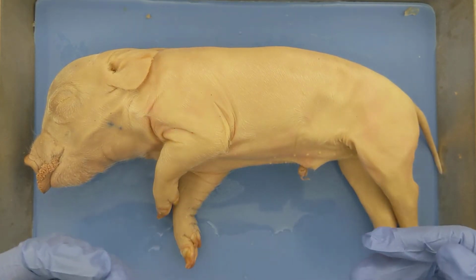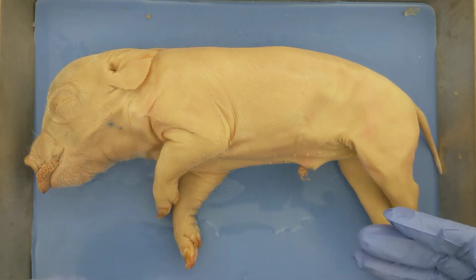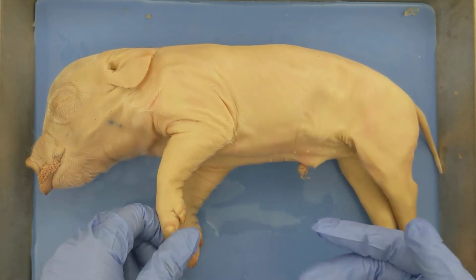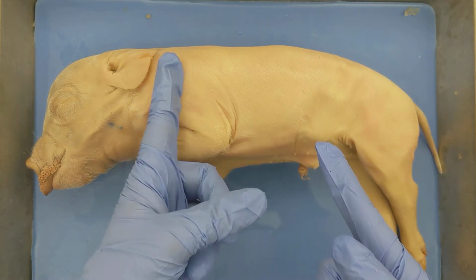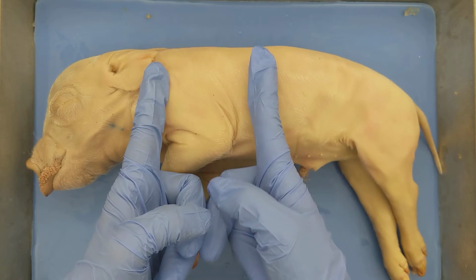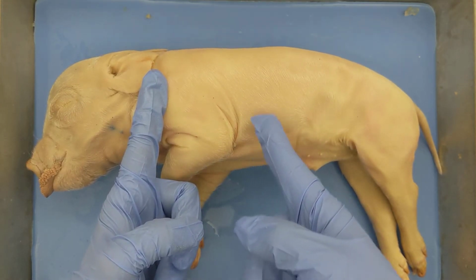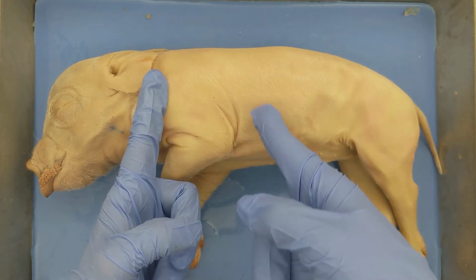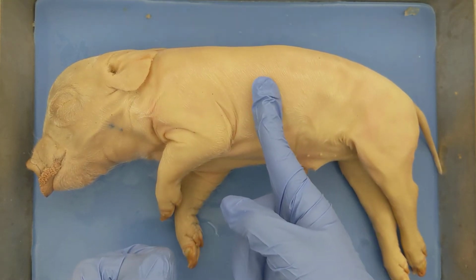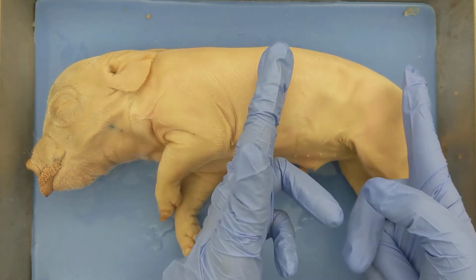And then there is a region that is a little hard to see externally, the thorax region. Now the thorax is going to contain the pig's lungs and heart, and it's pretty easy to see when we cut the pig open. But externally, you can think of the thorax being here from the shoulder blades until about the pig's midsection. Internally, there is a muscle that sits right underneath the lungs. I'm not going to tell you what it is, I'll have you look it up. But that muscle that sits right underneath the lungs, that is what separates the thorax region from the abdomen region.